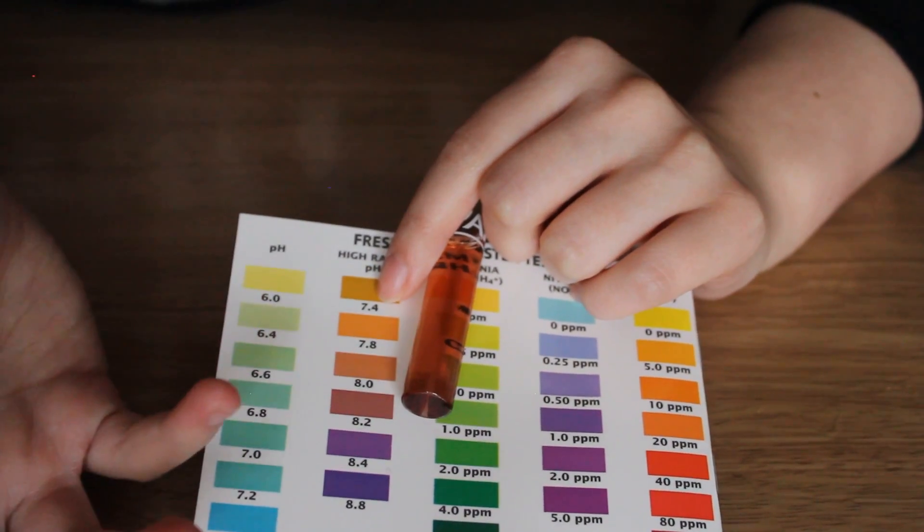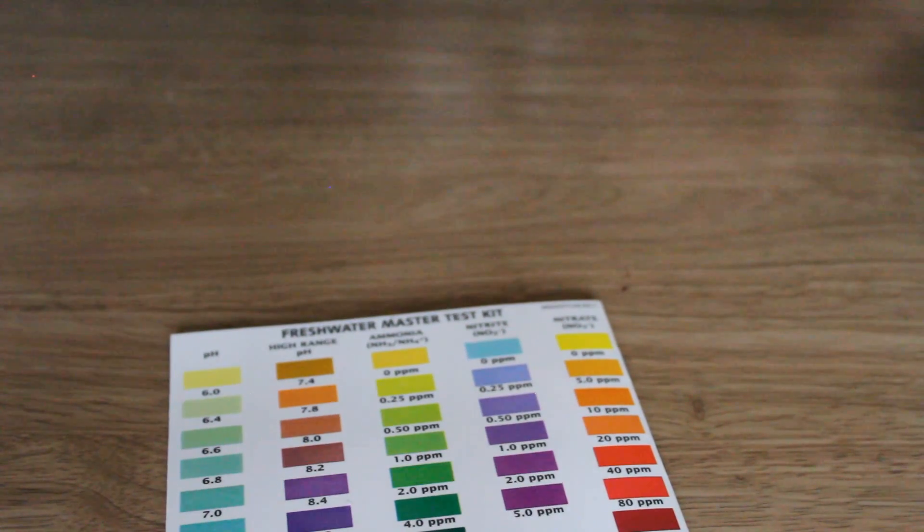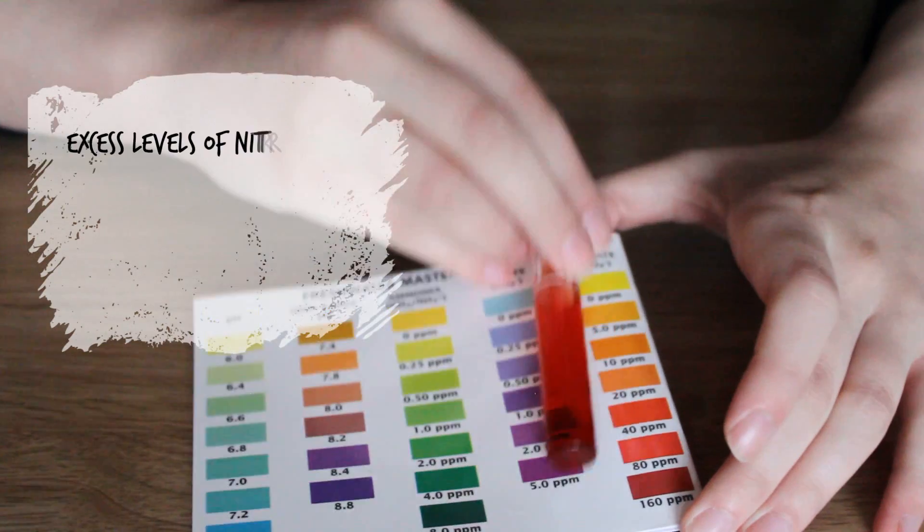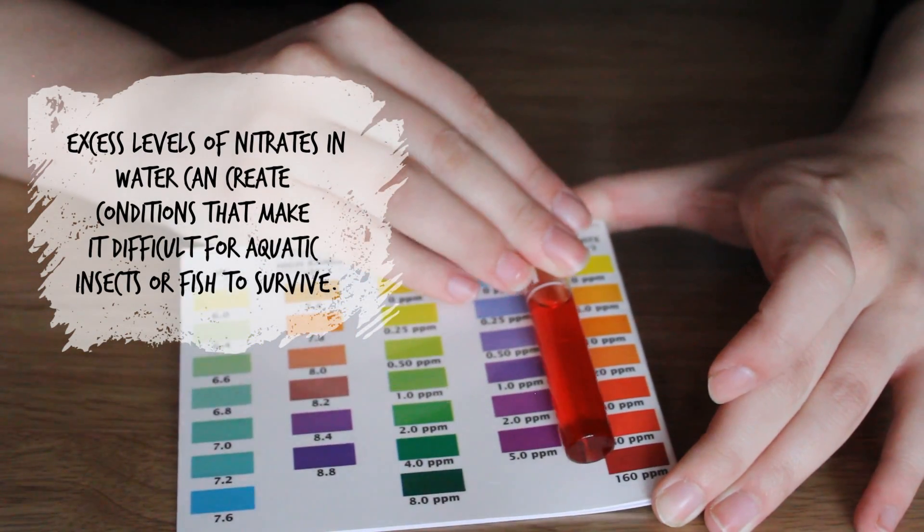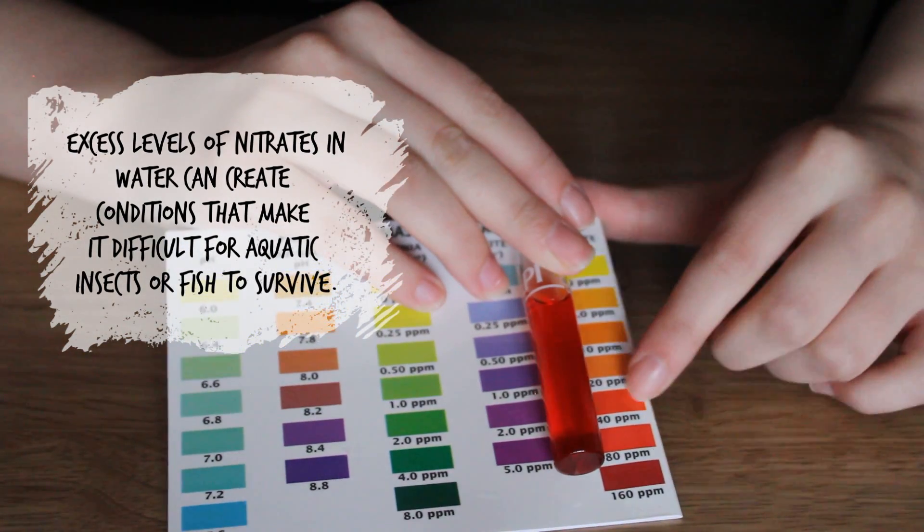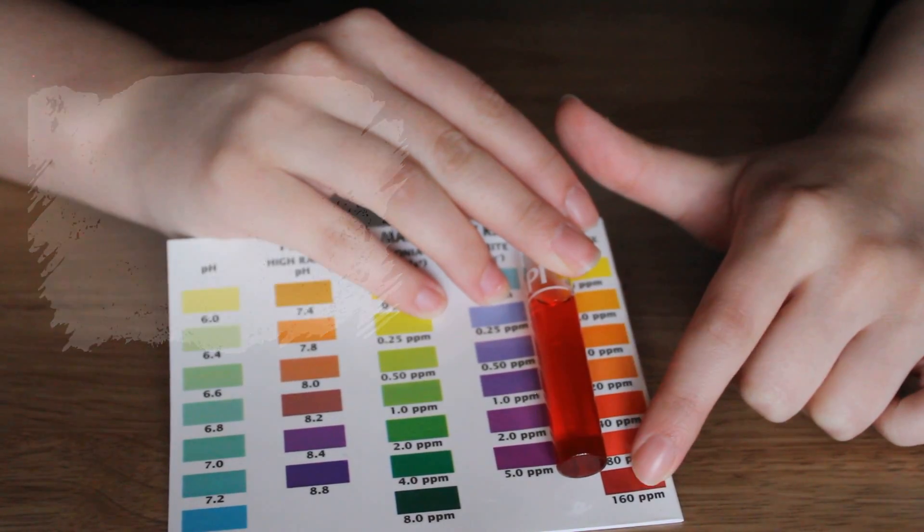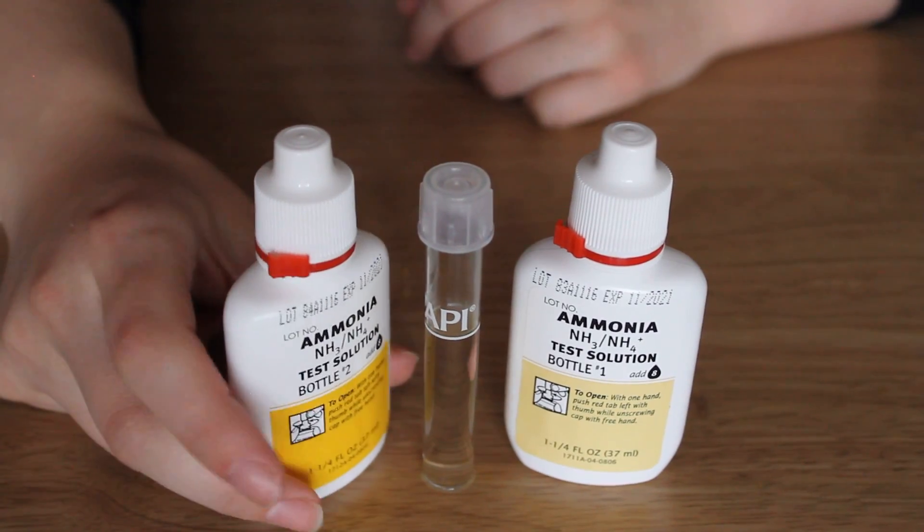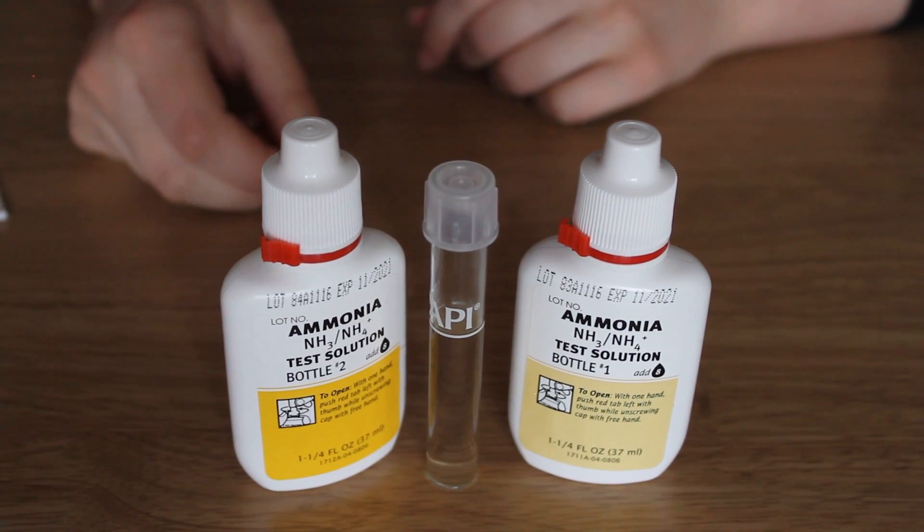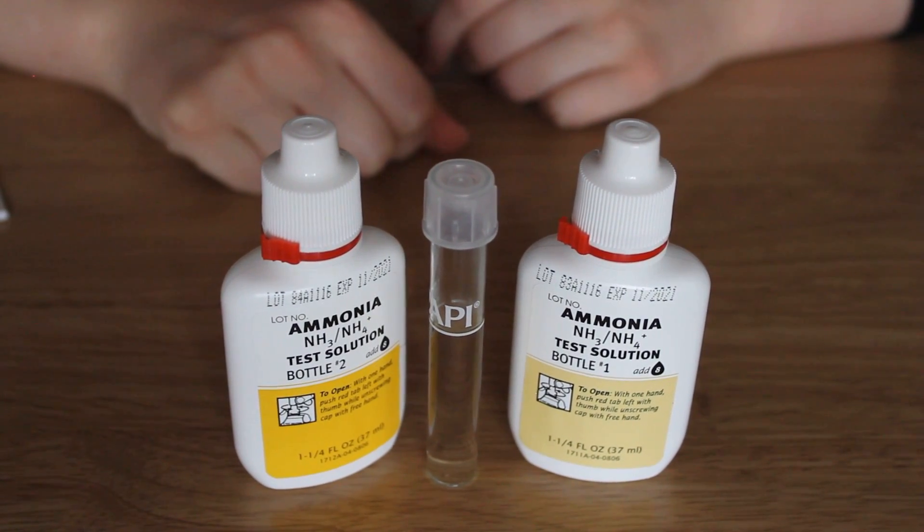As for the nitrate test that is now complete. As we can see it's a very deep red. Let's say between 40 and 80. I don't think it's dark enough to be 160. The final test we need to try is the ammonia and I don't believe that was on the test strip so I literally have no indication of what this could be.